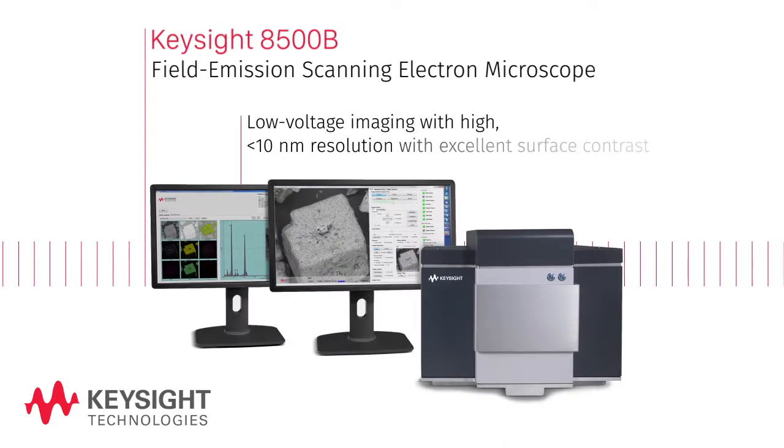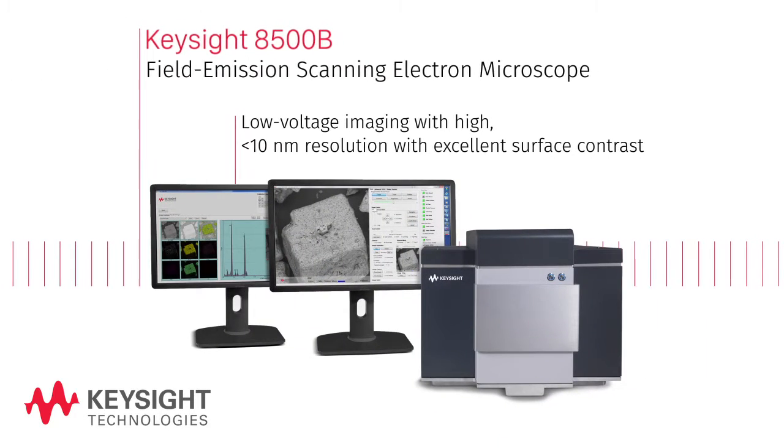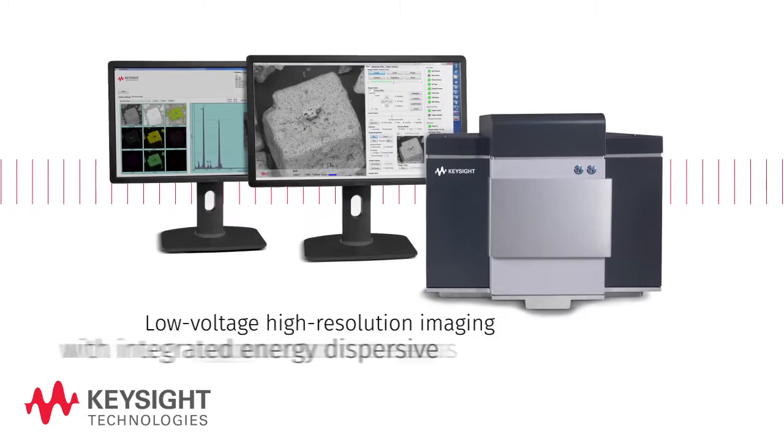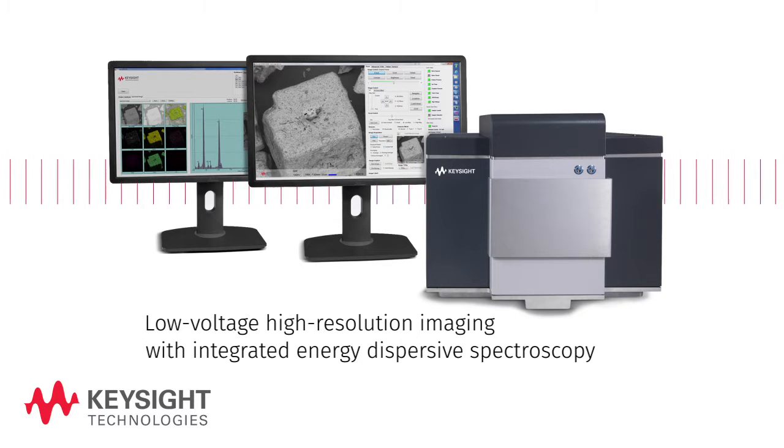Welcome to Keysight's new compact 8500B FE-SEM, now with optional energy dispersive spectroscopy capabilities.